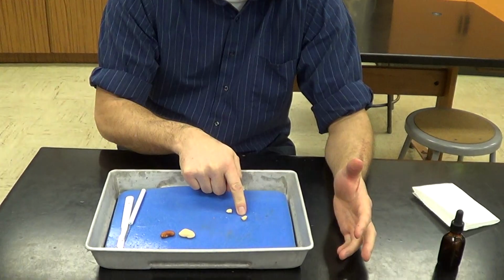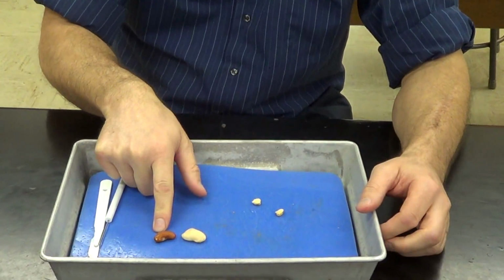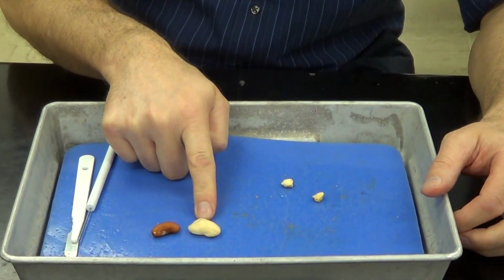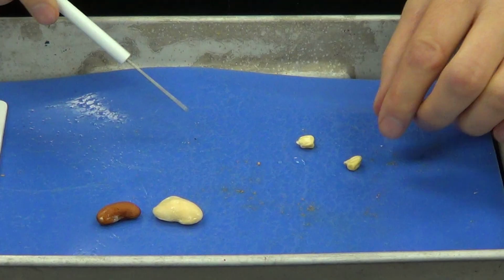Okay, today we're going to be doing a seed dissection, and I've got a corn seed, which is going to be our monocot seed, and I've got two dicot seeds. I've got a kidney bean seed and a lima bean seed. Those are going to be our dicot seeds. We're going to go ahead and get started with the corn seed first.